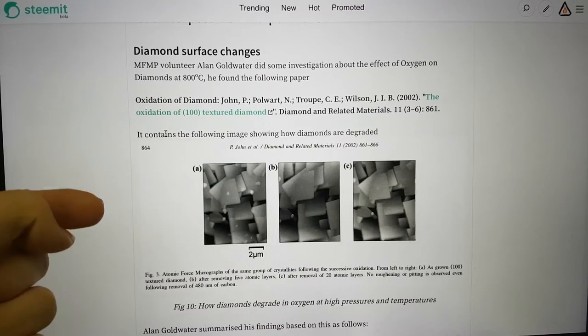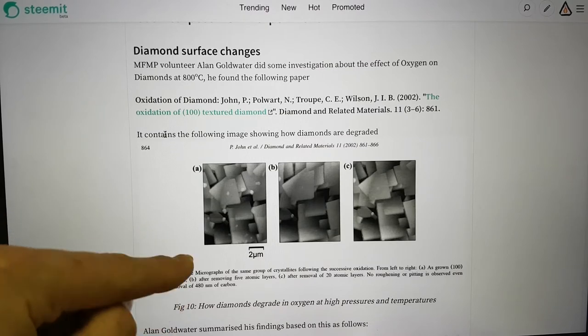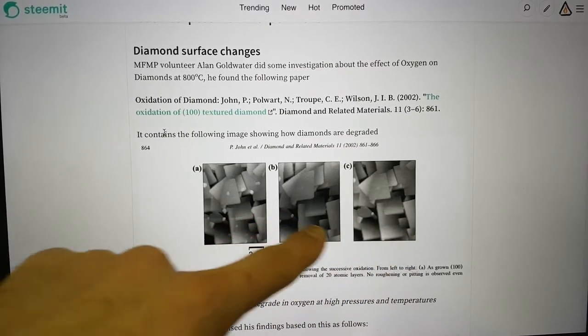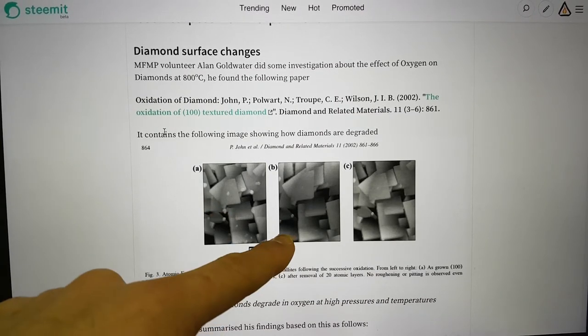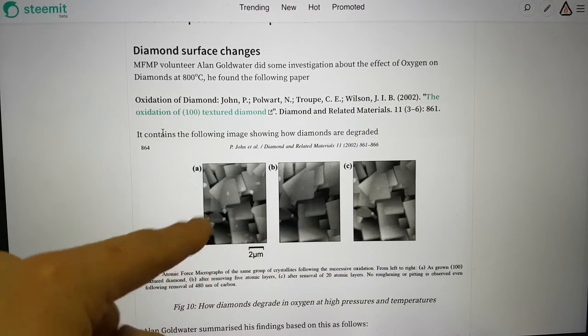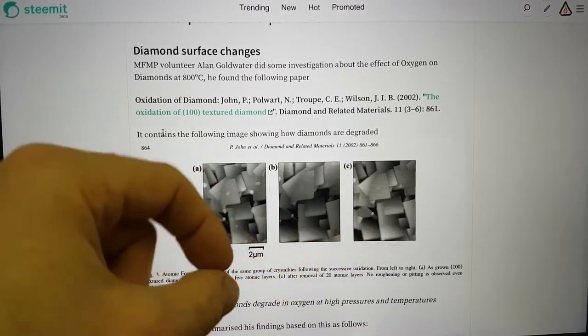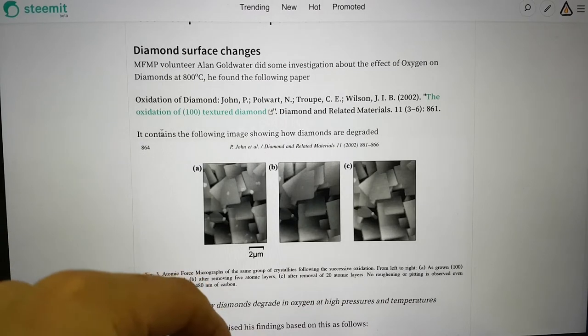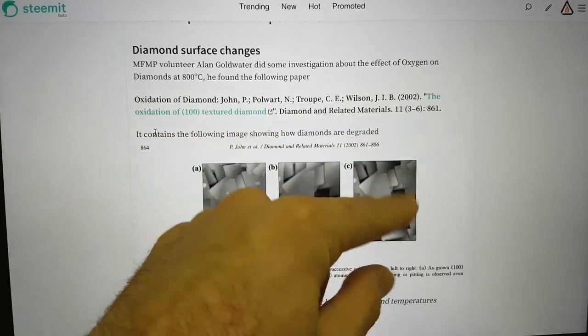This is three different stages where they have, these are as grown, and this is after oxidation at high pressure and temperatures. Essentially what happens is the diamond doesn't really change its overall shape, it just loses mass from all sides in equivalent ratio.